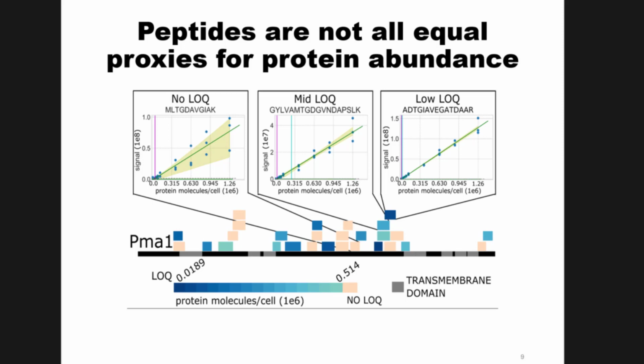And then each of these colored boxes is a different peptide I detect by mass spectrometry. So I detect a lot of proteins. This is pretty decent coverage. You notice we don't detect every part of the sequence on this protein. There are some regions in a protein where there are just no good tryptic peptides. Some regions have a tryptic peptide, but for whatever reason, they either don't digest or they don't fly. They don't ionize well is what we mean when we say they don't fly.